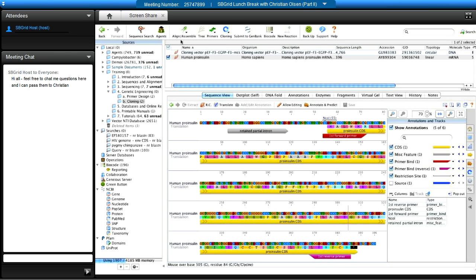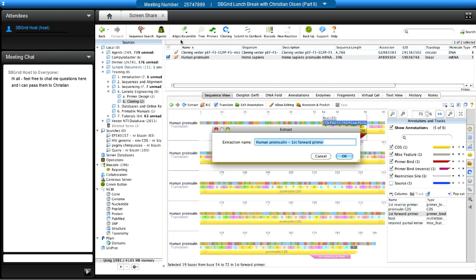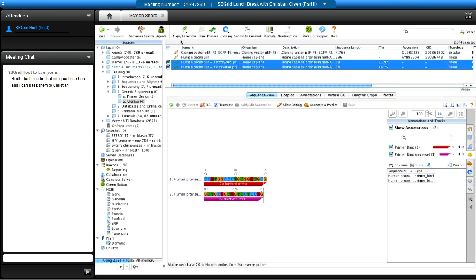Clicking OK designs the primers and maps them onto the human pro-insulin CDS. They have directional indicators — one pointing right, one left — labeled 'First Forward' and 'First Reverse,' and are added to the annotations menu. You can double-click or right-click to extract the primers and give them a relevant name such as 'Human Pro-Insulin Primer.' They receive green directional arrow icons in the local directory, and you can test with those saved primers.